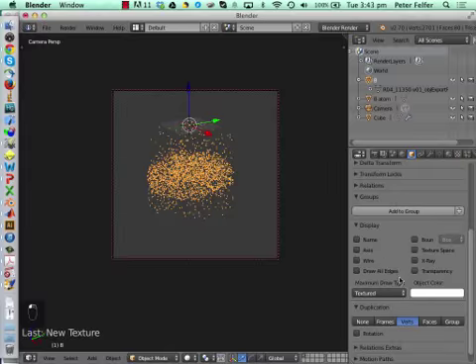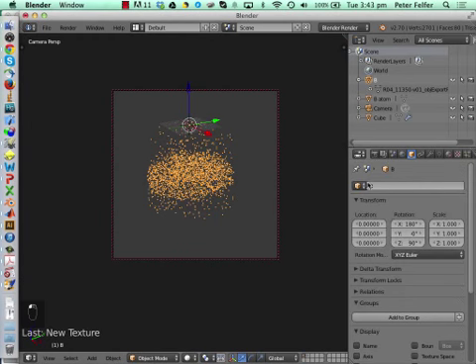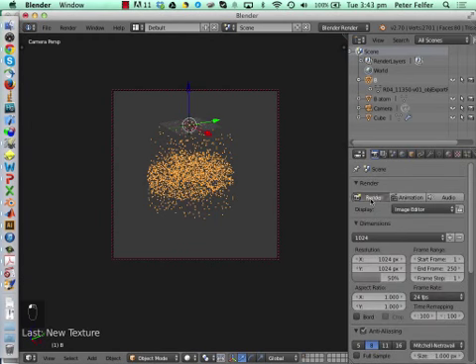Oh, standard mistake. We still got the vertex duplication switched on. I need to switch the vertex duplication off because otherwise it doesn't think it can render the object. It thinks the object is just a parent object for a vertex duplication. Got rid of the vertex duplication.